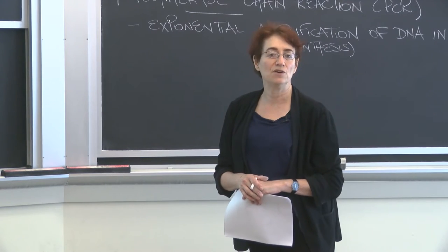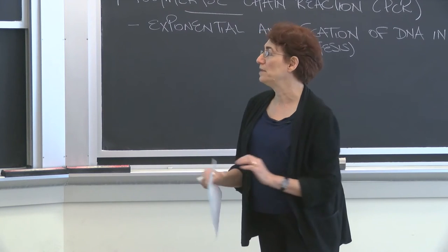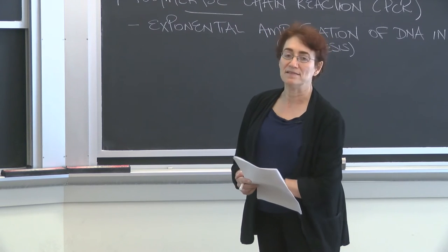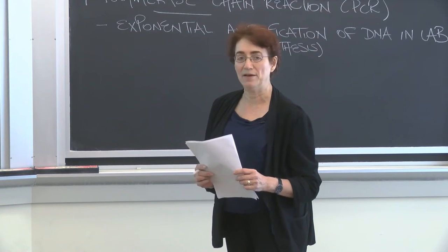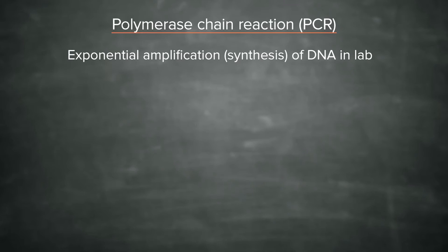You can use PCR for forensics. You can use PCR for a whole huge number of different things. It is a technique that really has had an enormous amount of traction in genetic engineering. And that's why I want to discuss with you now the basic idea behind PCR. Here's the basic idea.